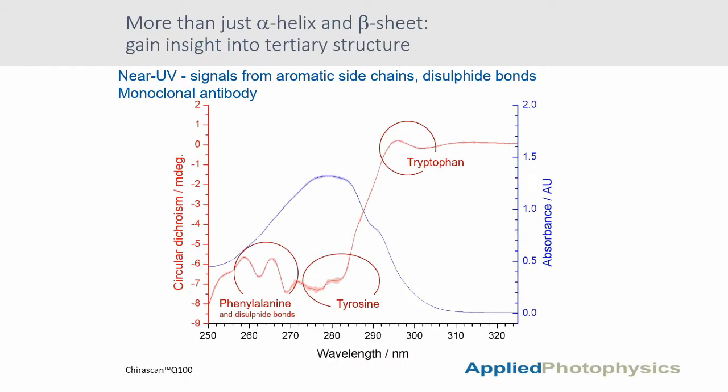And the tertiary structure, that is the near UV-CD probe. So depending on the secondary structure or the chirality of the structure around these aromatic amino acids, we can say whether the structure is chiral or not. So I'll show you again some examples as we go on.